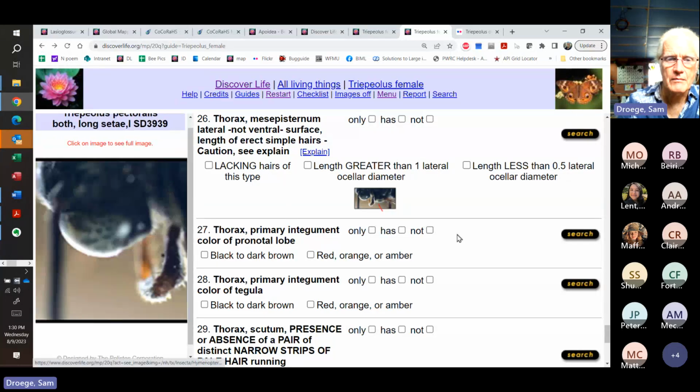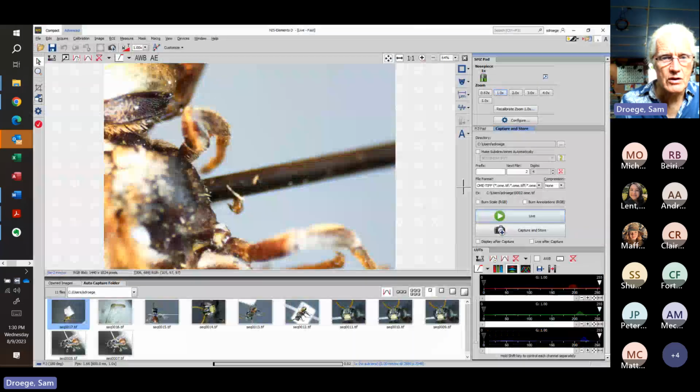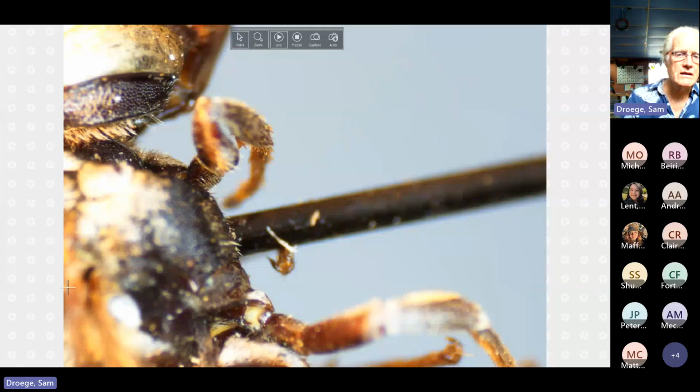And I'll show you a picture on screen of a specimen that I have here. So we're under the microscope now. We'll do this at a much higher resolution. No, it's F. It'll get us there. Here we go.